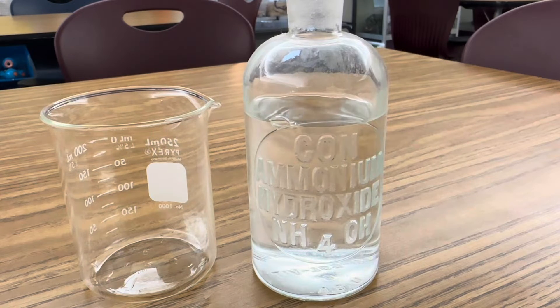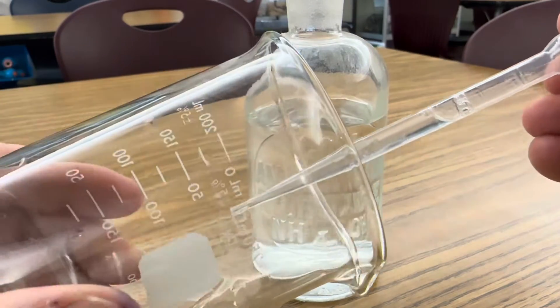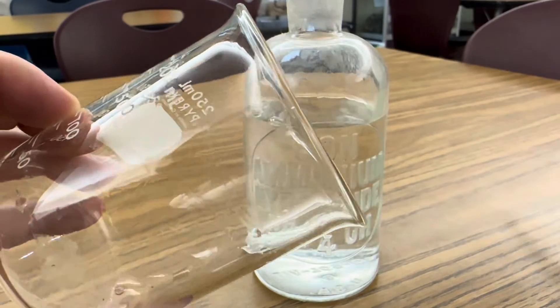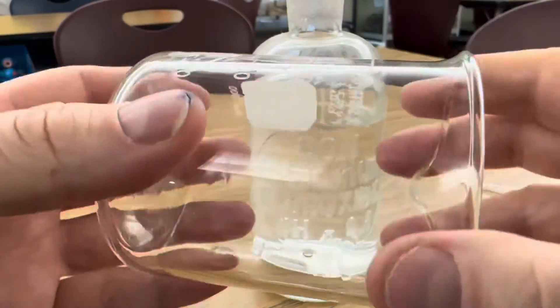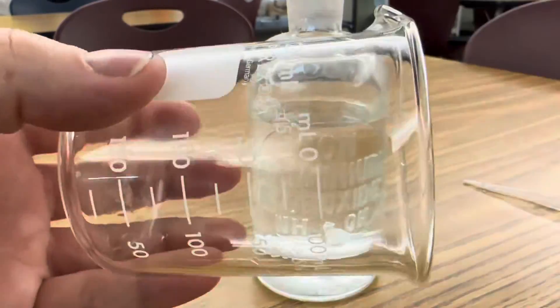In the same way, take your other empty beaker and put a few drops of ammonium hydroxide along the wall, just like you did with the hydrochloric acid, and then roll it around so it coats the wall of the beaker.